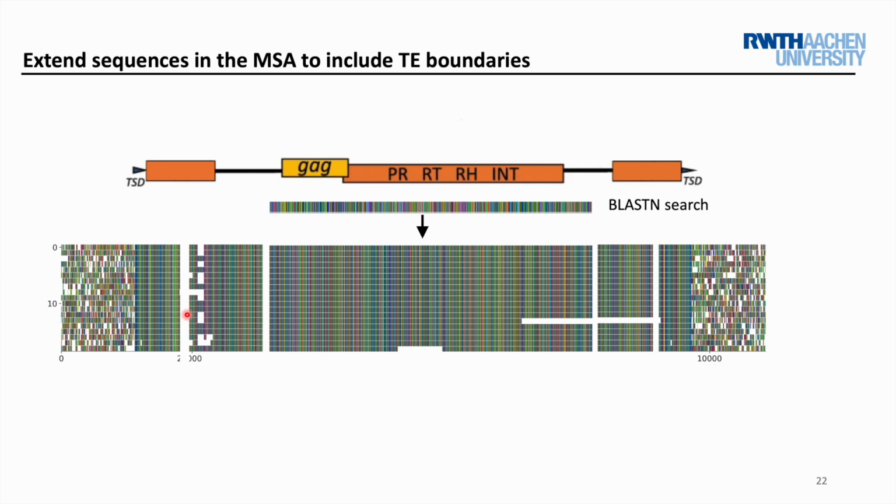Then come to the second limitation. We say that, for example, for the top 2, here's the top 2 sequence. Let's say they are fragmented sequences. After the first round's extension, for those 2 sequences, possibly only 1 round extension will be sufficient. So in the next round extension, you only need to extend the rest of the sequences, but not the top 2. So to solve this limitation, let's zoom in on the left part here.